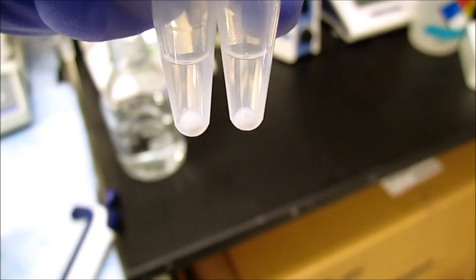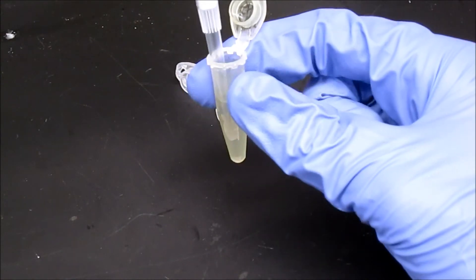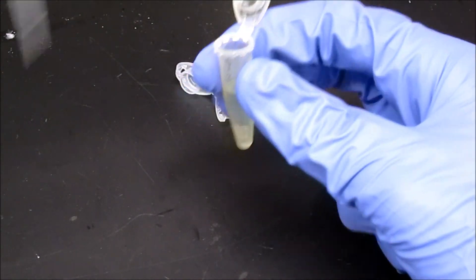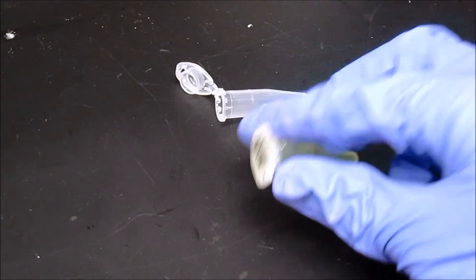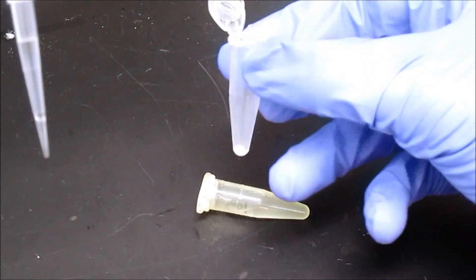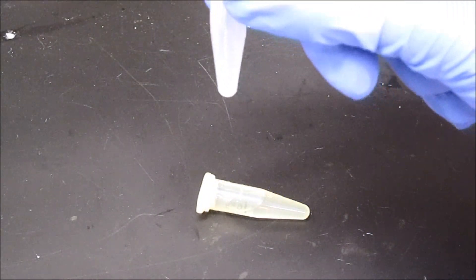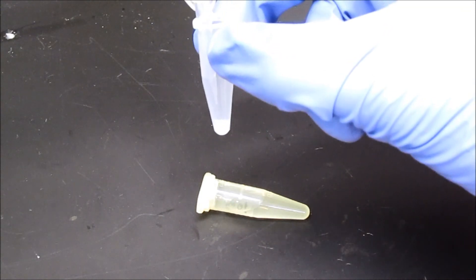Once this final pellet is obtained, 100 microliters of 10 mg per milliliter PEG-thiol is added to each sample. PEG, or polyethylene glycol, increases the stability of liposomes and helps protect them from being cleared out of the bloodstream.